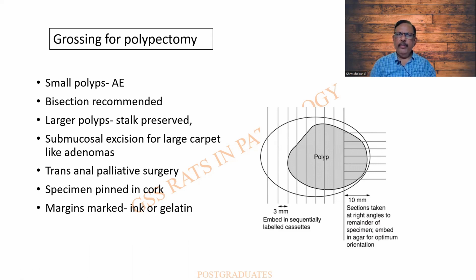Through and through. Probably they want to rule out any kind of minute invasion of the lamina propria. Lower down, however, the infiltration into the muscularis becomes important and therefore multiple parallel sections are being cut. So kindly do understand this is another school of thought which we should be having in mind. And these are given over here.